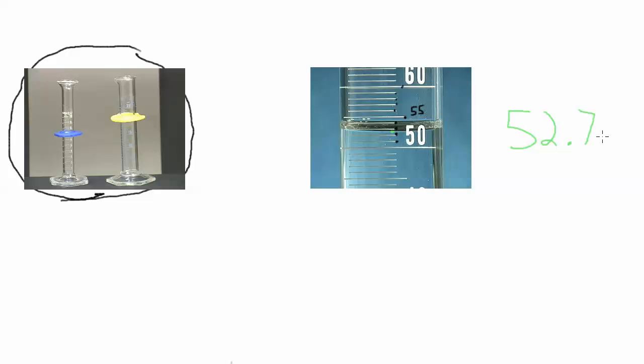And then this is a graduated cylinder, so it's measuring in milliliters. So that's just how you read number lines for making measurements.